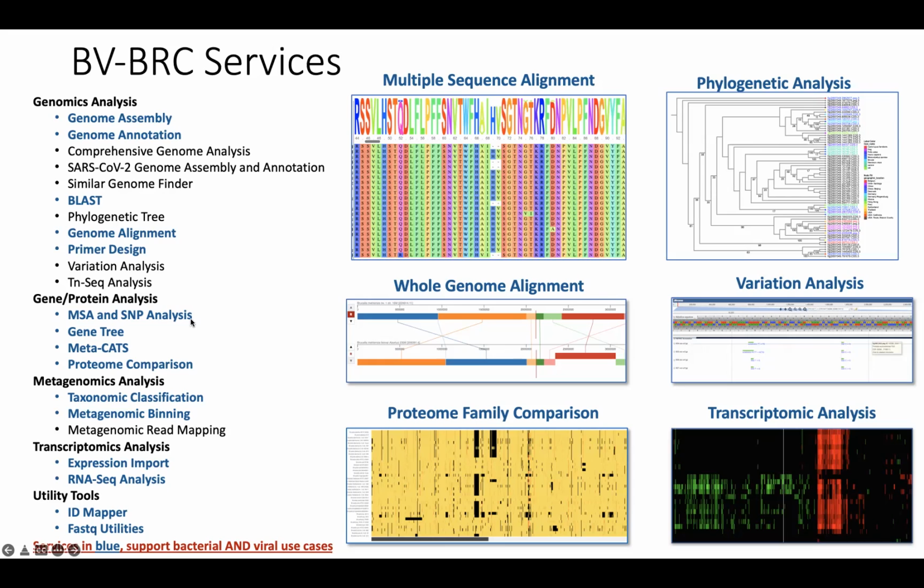The goal is eventually to make any of these tools that can be applied to both bacteria and viruses applicable to both. So for example, genome assembly or reference-based assembly or metagenomic read mapping, all those services will eventually be able to be used for viruses and bacteria.